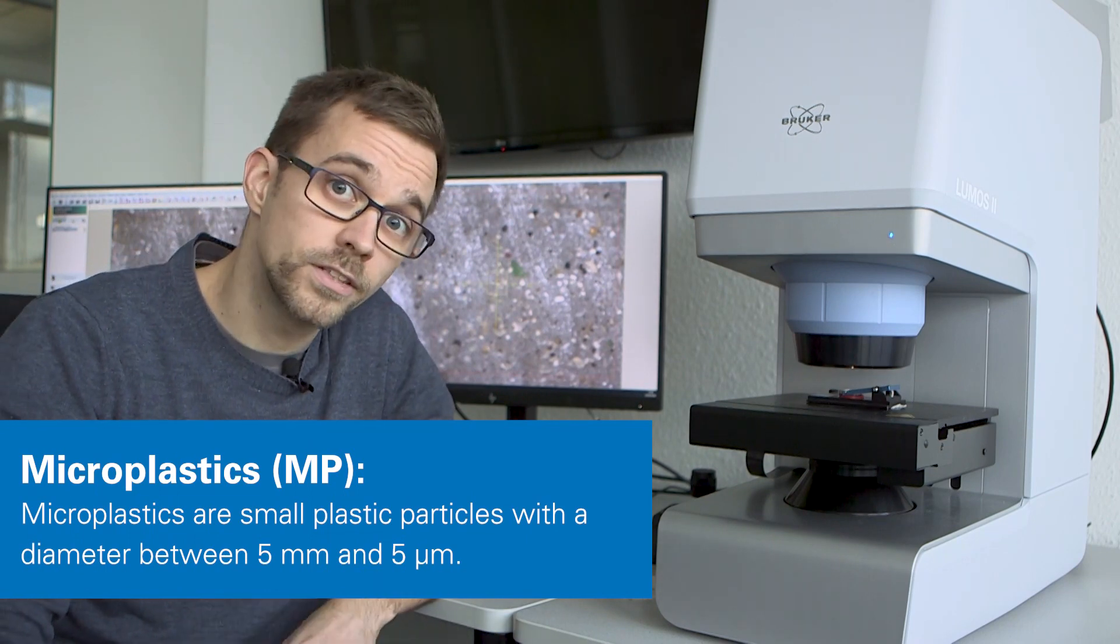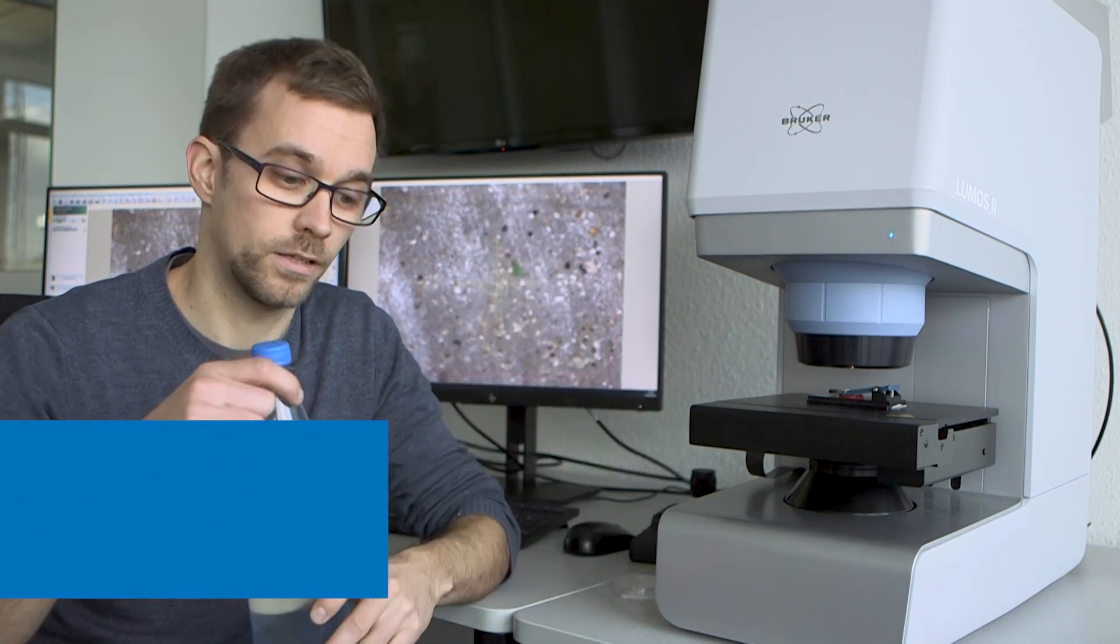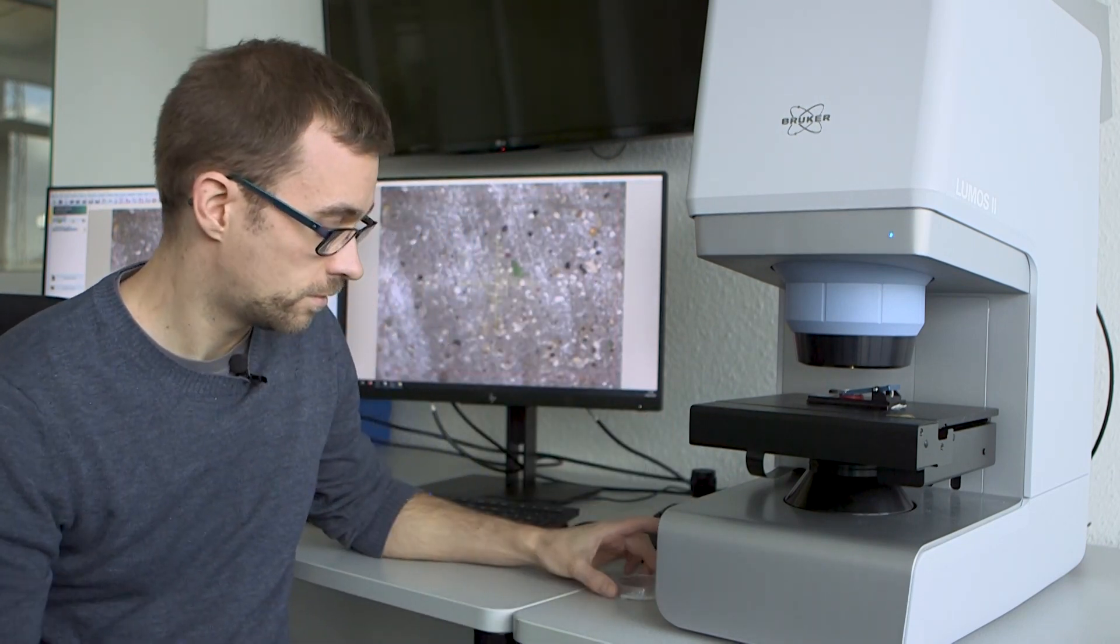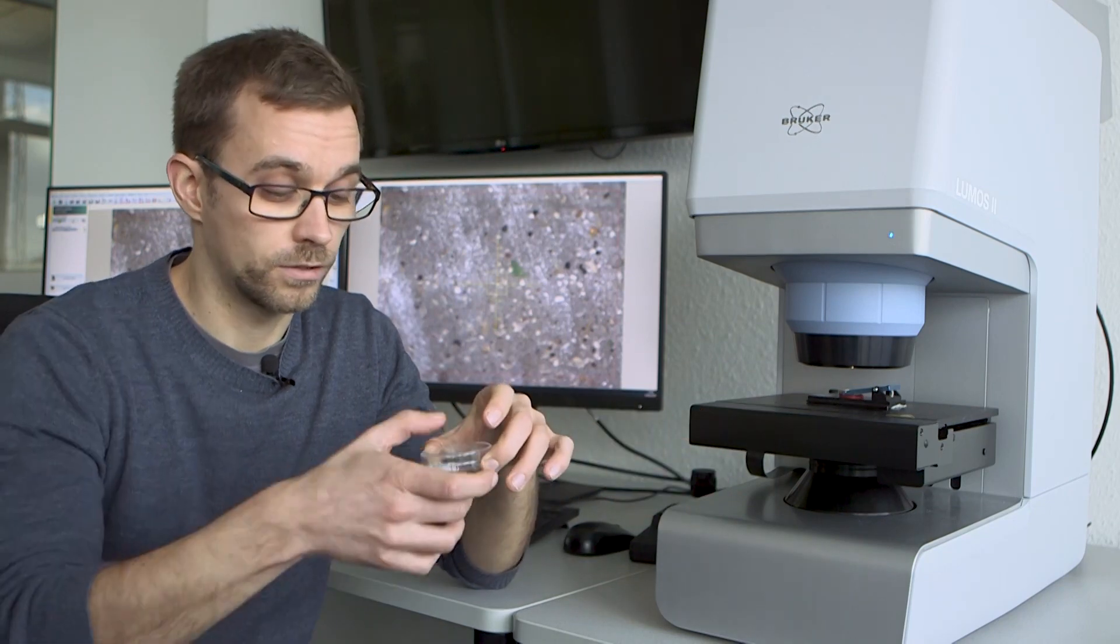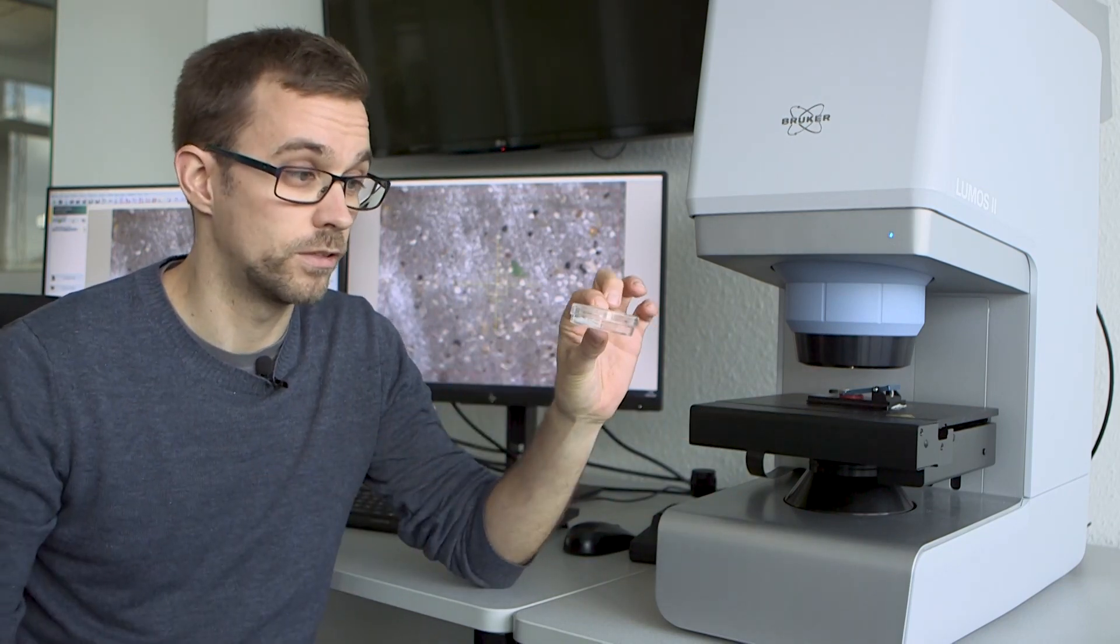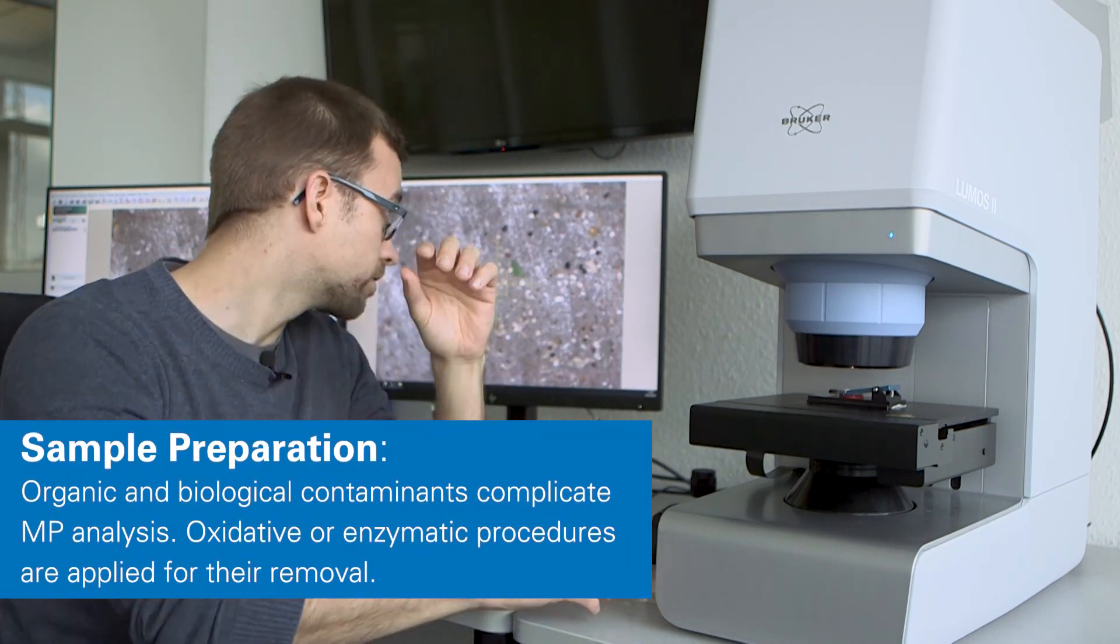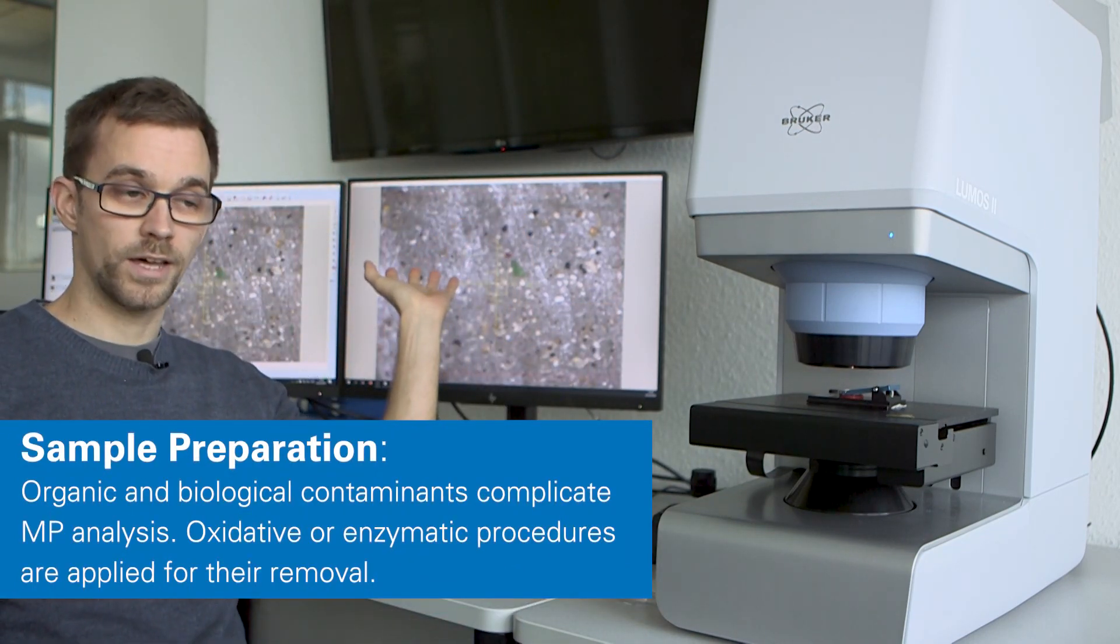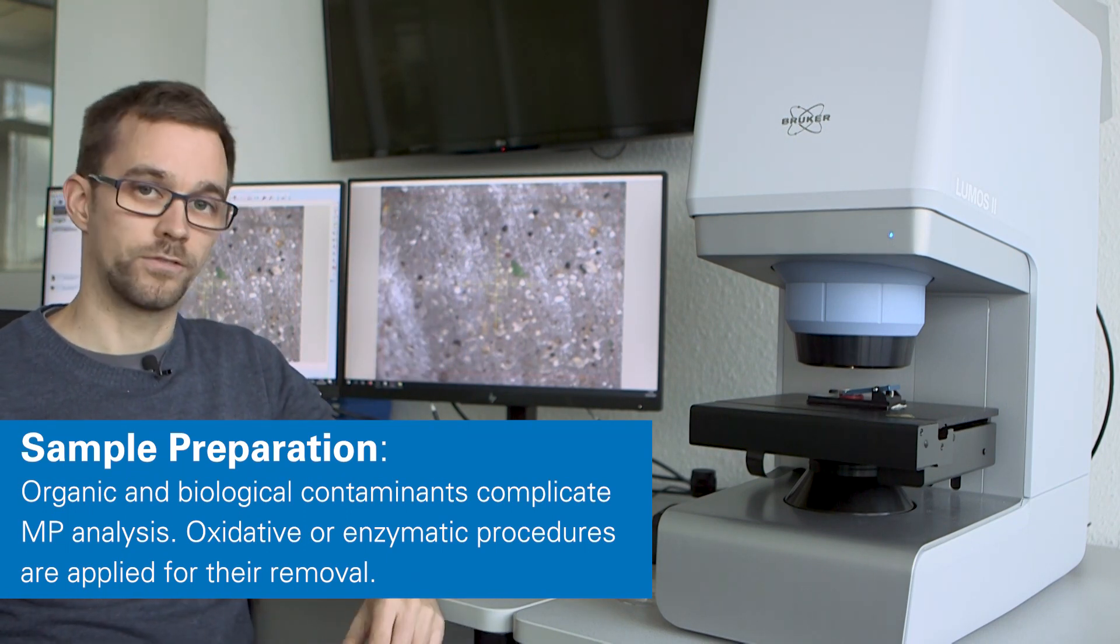There are several different types of samples like bottled water that just needs to be filtered and then can be analyzed, sea salt or table salt that can be analyzed towards its content of microplastic that needs to be dissolved first and then can be filtered, or more complex samples like sediments of riverbed that need pretreatment like enzymatic digestion or oxidative treatment.